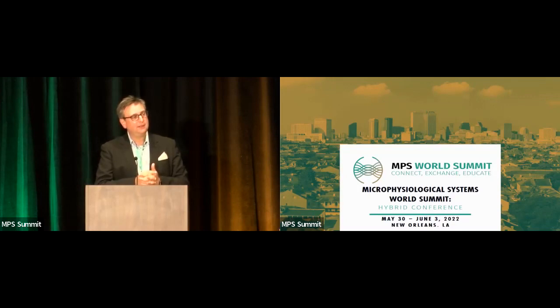Lance, can you use the microphone? So Lance's point was uniformity and how you could drive a single tissue into a specific zone. So that's something that we're currently not doing. We're keeping constant oxygen tension.